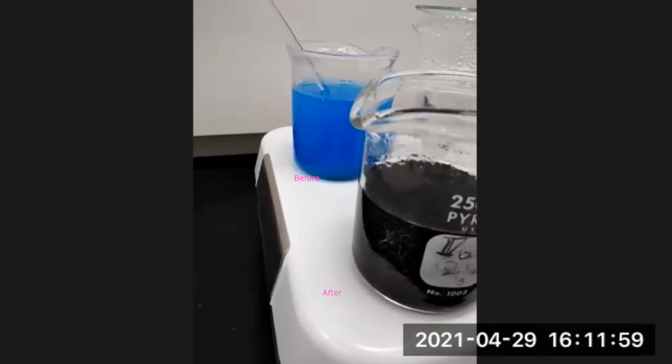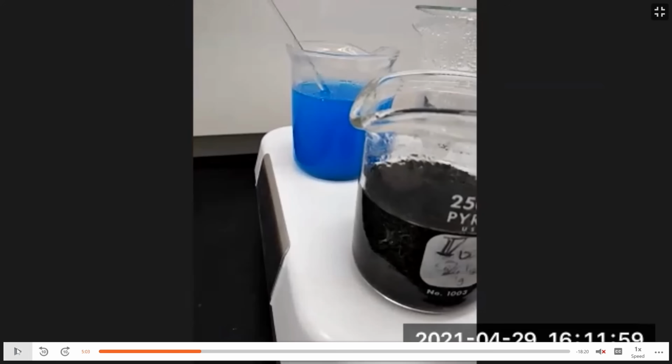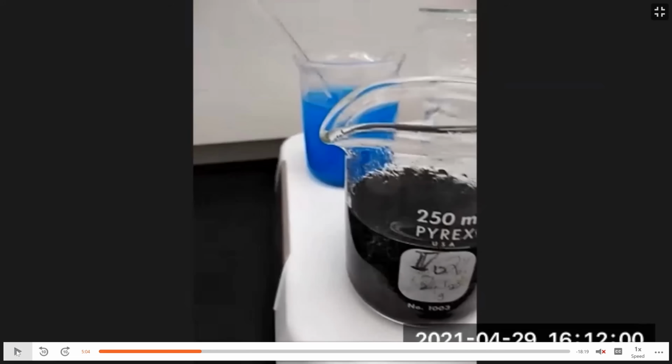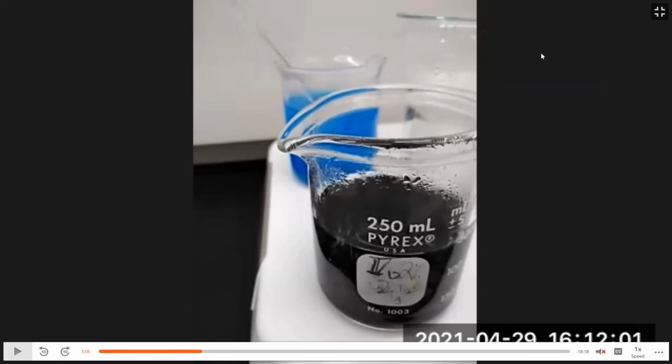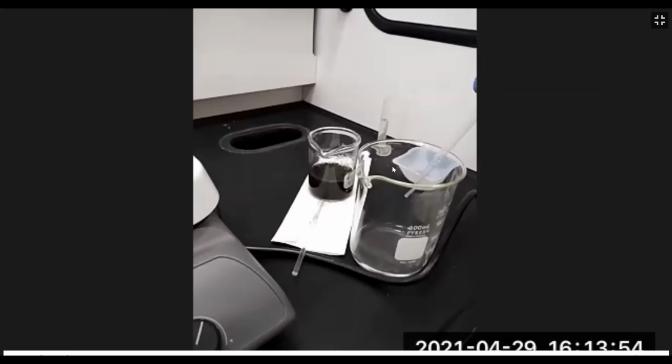So this is when you stop, you're going to let it settle to the bottom, and you're going to use a dropper and kind of remove or decant the solution from the product. So next you want to decant off as much of the solution as you can into a waste beaker.